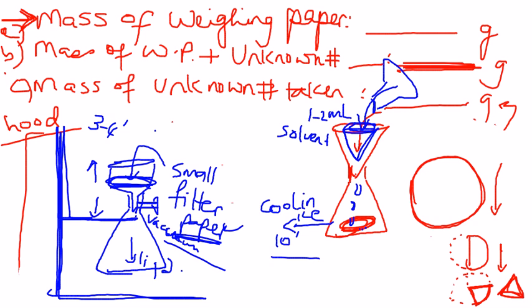So I would gently, with a very light hand, if after 3 to 4 minutes, just see from the side if it seems dry or if it seems cakey and chunky. If it seems a little bit chunky, give it another additional 1 to 2 minutes. But if it seems dry, then that should be good to be used for the melting point. You already know how to take the melting point. You have to make sure it's a powdered sample and it is packed well in the capillary tube, and then you'll take at least 2 melting points to see if your compound is one of the 4 that I have mentioned in the student notes.